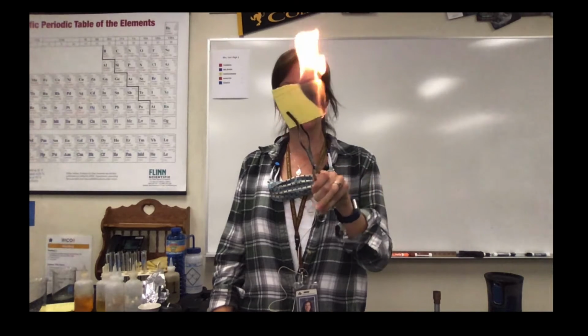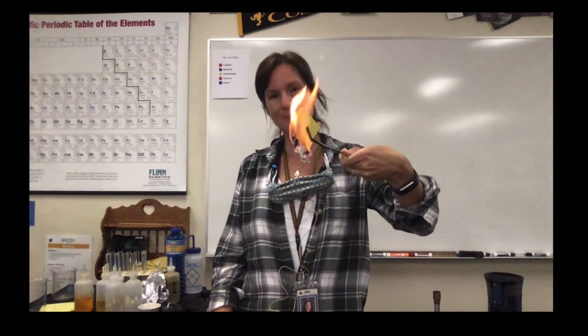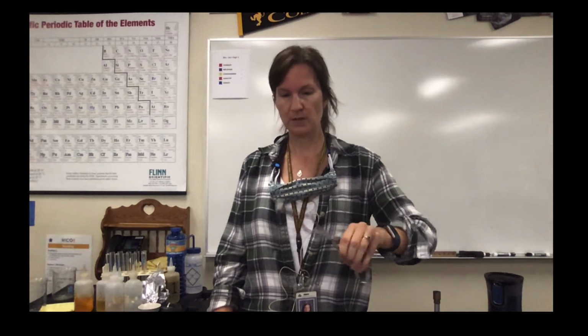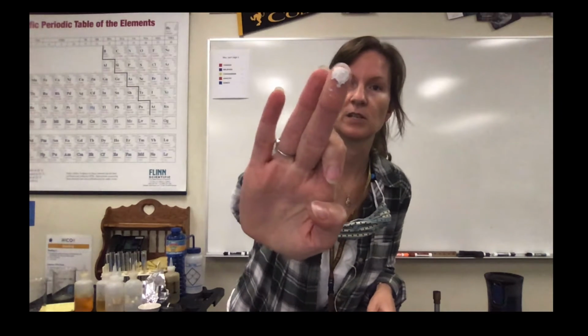Demo number 2 is burning paper. So observations again before. You can make observations during for sure if you would like in terms of the change you're seeing. And then obviously you can make observations about the material once it's done burning, after. You can picture, right, this is the material afterwards, this kind of ash looking material.